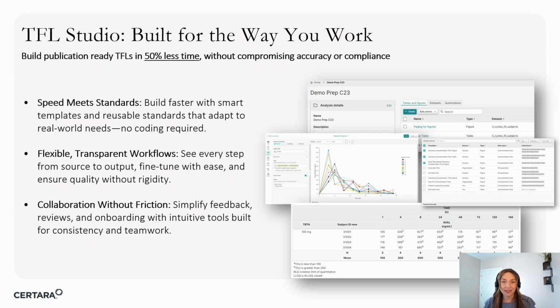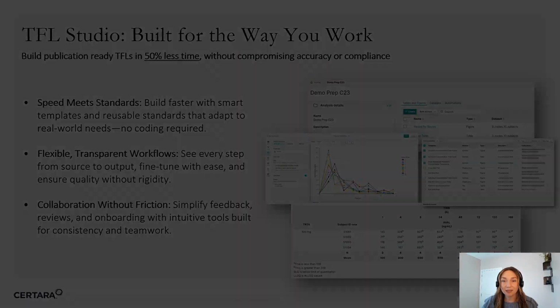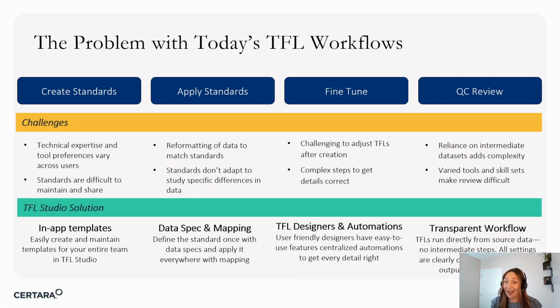And finally, we're going to allow you to collaborate without friction. So we're going to simplify the way that you get and receive feedback. And then it's going to make onboarding a lot easier because the tools are going to be a lot more intuitive. And this is going to increase both consistency and teamwork. Just to give a little bit more clarity on how TFL Studio is going to address these workflow challenges, I've paired some of our features in TFL Studio up against the challenges.